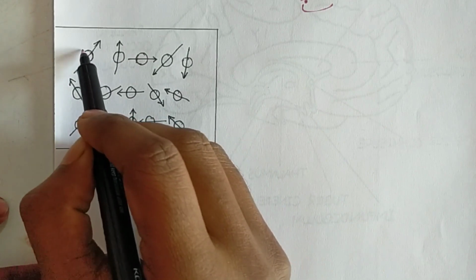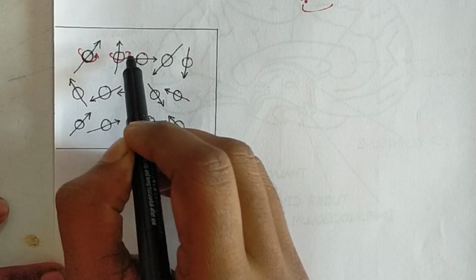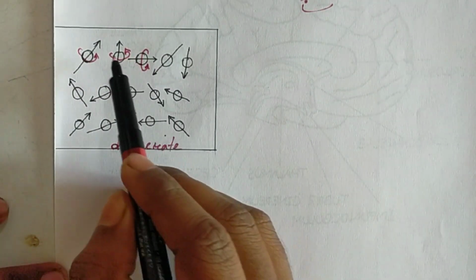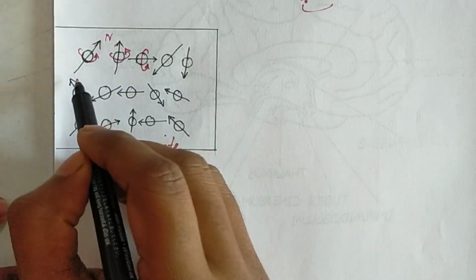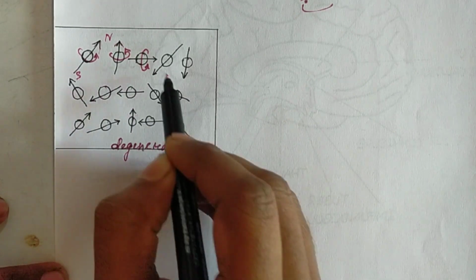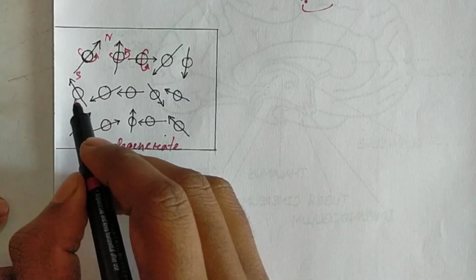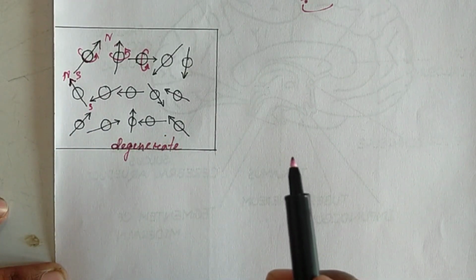Suppose this nucleus is spinning in this direction, this nucleus is spinning in this direction. This is the north pole, this is the south pole. So each nucleus has a north pole and a south pole.